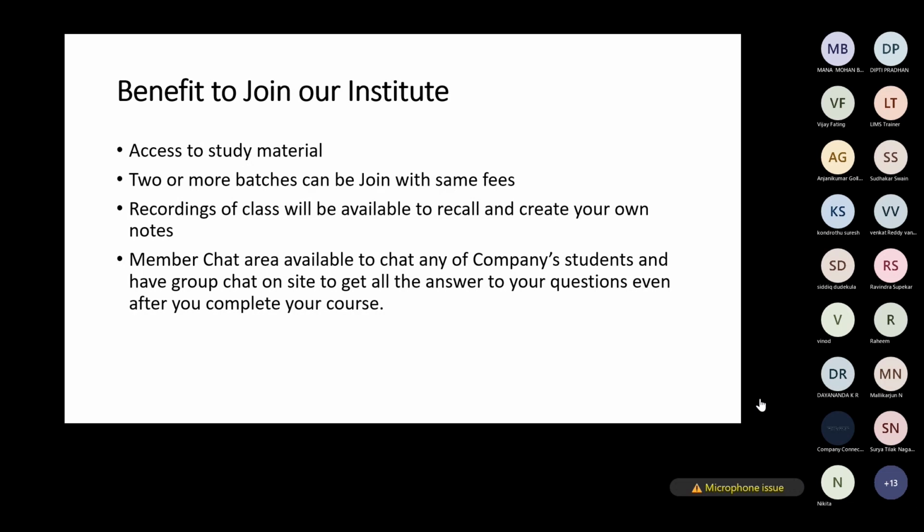Okay, thank you. Sir, one thing I want to know: after completion of this course, will we have the knowledge to handle the ELN, how to create the ELN, and how data has to be generated or input? I'm not sure whether ELN is a part of this course or not, because ELN is another topic, that is electronic laboratory notebook, right? You're talking about ELN, right?